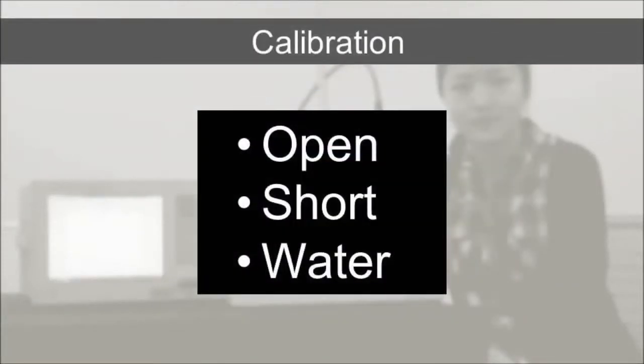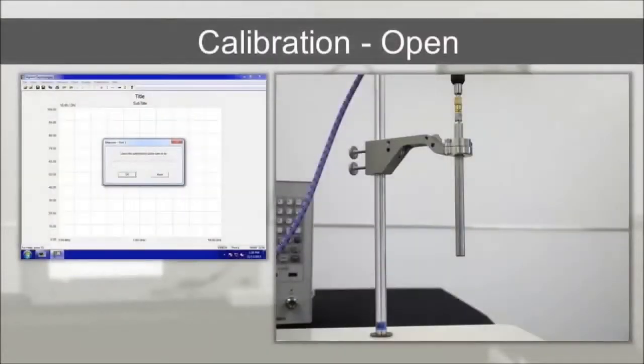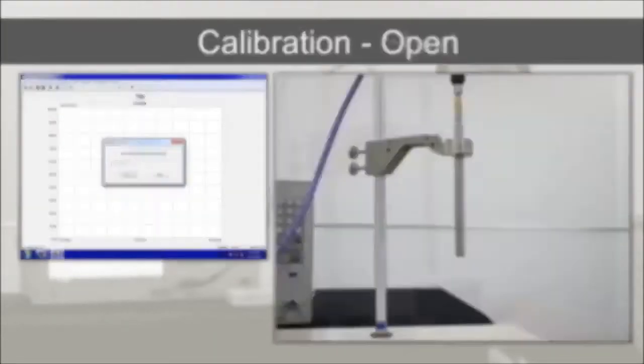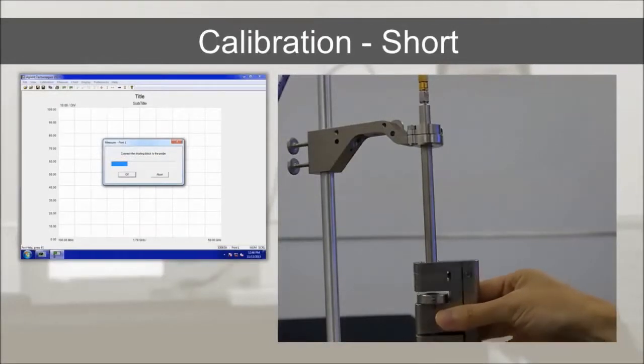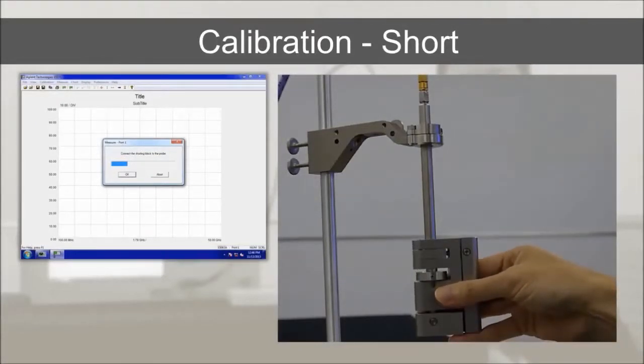Here, we will use three standards: open, short and pure water. Leave the probe open in air. Connect the shorting block to the probe. And then place the probe in pure water.